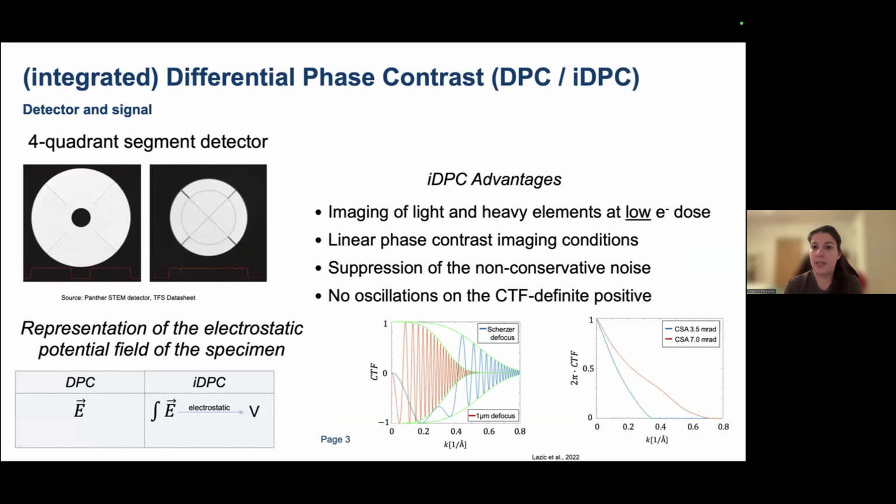Here, in the differential phase contrast method, to be able to capture this kind of signal, we use at least a 4-quadrant segmented detector. In our case, the Panther detector. And with that, we are able to detect the displacement of the electric field. As the electric field is electrostatic, we are able to integrate that and have the electrostatic potential field, which is representative of the material that we have.